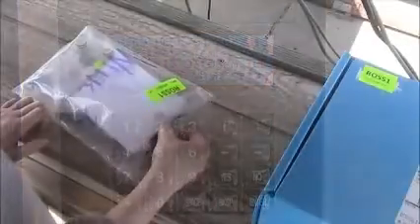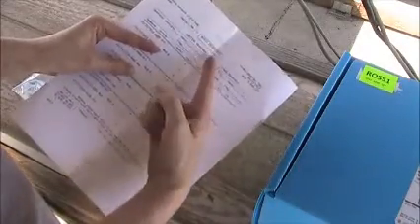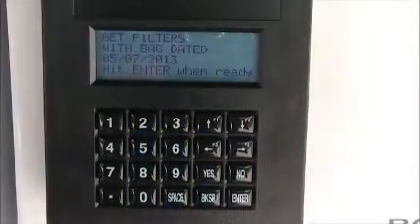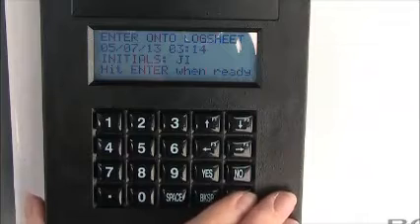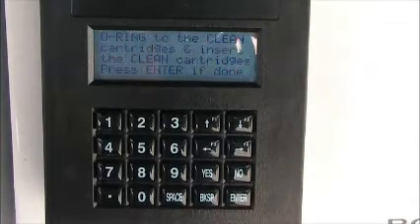Make sure to check the date on the new Week 3 log sheet to make sure it matches the controller's display date and the date on the front of the box. Press Enter. The controller will then tell you to perform a non-standard sample change and to move the O-ring sets into the empty hole in the Week 3 cartridges.